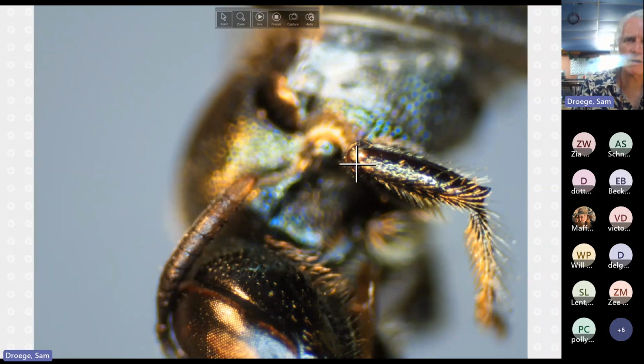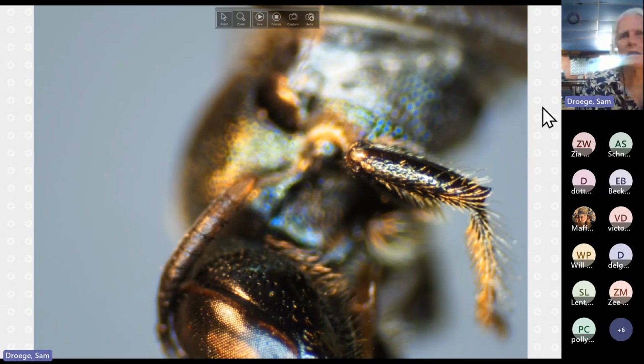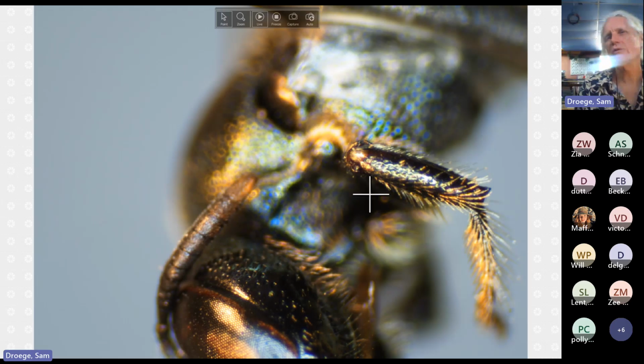And this is the white mark area of the tibia. And so it doesn't extend down far, but what's this? So this area here has this sort of vague, if we were to look at it under the microscope with our eyes, you'd see that this is a bit ambery and maybe, you know, a different color than the matrix of the rest of the leg.